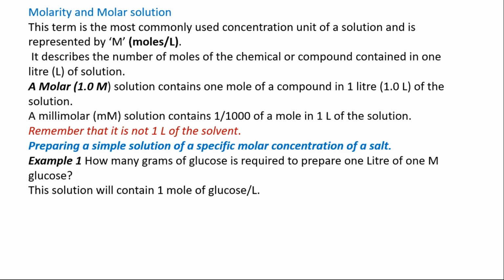So how do you prepare a molar solution? Preparing a simple solution of a specific molar concentration of a salt. What this statement indicates is, it is not that you just weigh out the substance equivalent to 1 molar and you add 1 liter of the solvent.